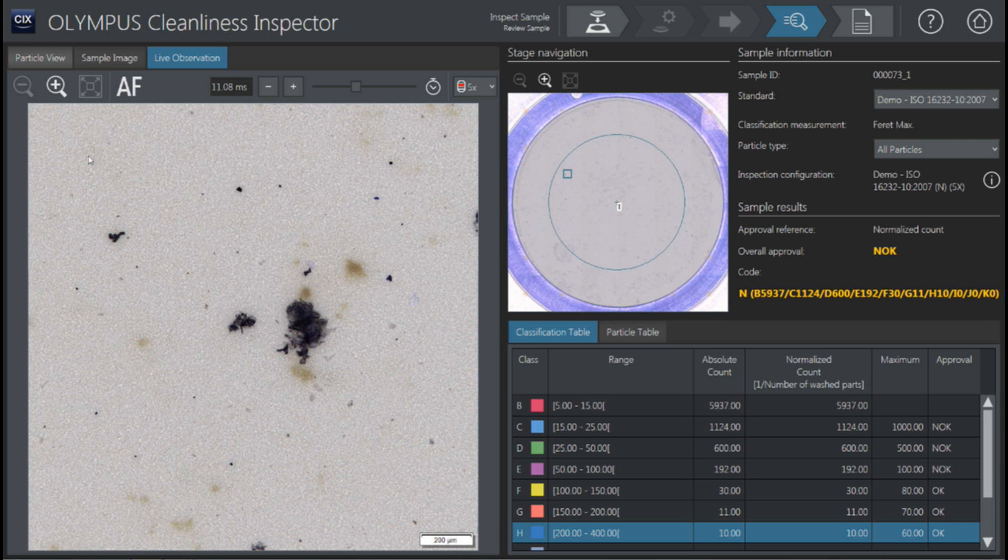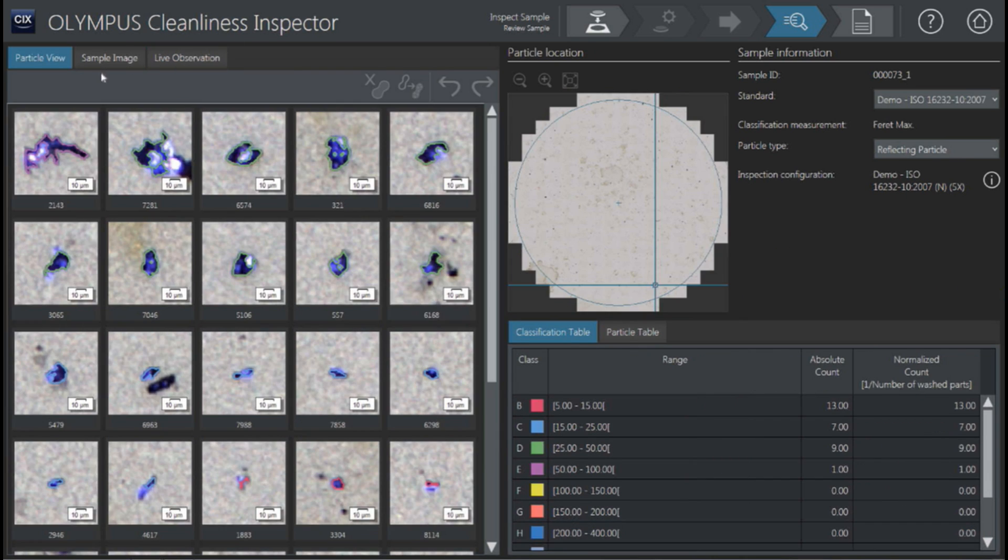Going back to our particle list, the other useful feature is if you wanted to see just those reflecting particles. Some customers are very concerned with their metal-type particles — if they have any, it's a failure. They want to make sure they're not a certain type. So you can actually drive to these particles as well, see them in live observation; they're kind of a reflecting metal particle — shiny. We call those reflecting particles, and you can sort those as well.